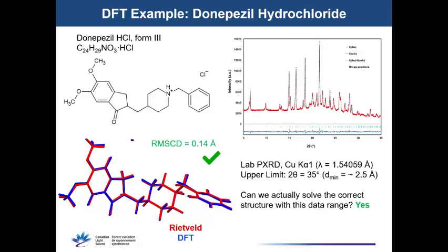They were just placed around the molecule. So some of the hydrogens are off a little bit, but they don't actually go into that RMS difference calculation. So basically what I'd do is I'd say the refined structure is correct. To actually study the hydrogen bonding, use the DFT results.